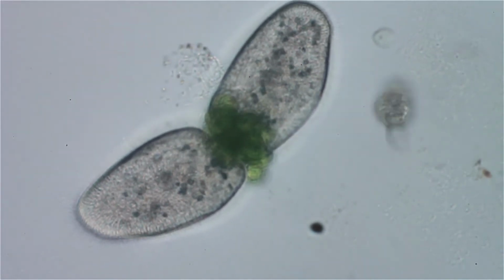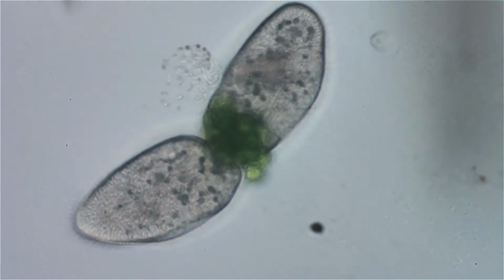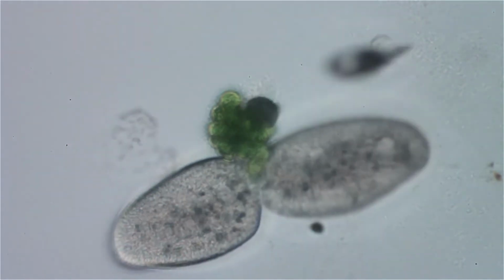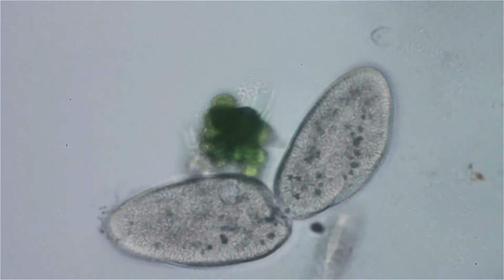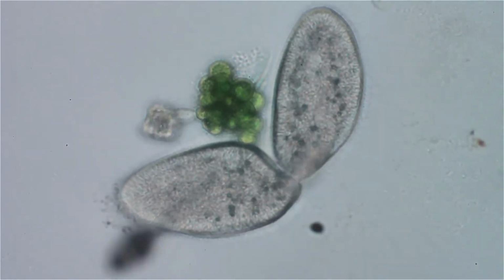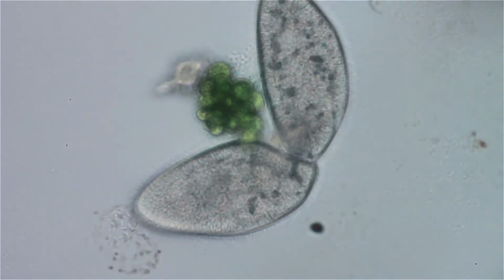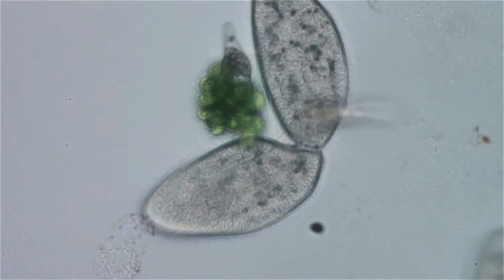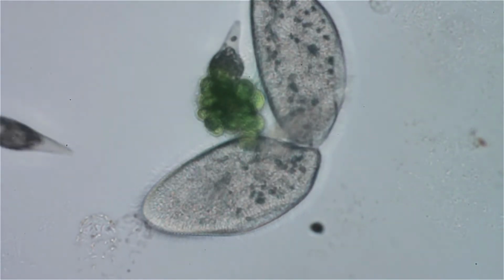Yeah, here's another one in the metaboloid motion. He's behind him now there at the top. I just noticed they can do that too. Most of them don't seem to be able to do it, or don't do it. And possibly that's because the slide is aging and the water's getting old under the cover slip there.